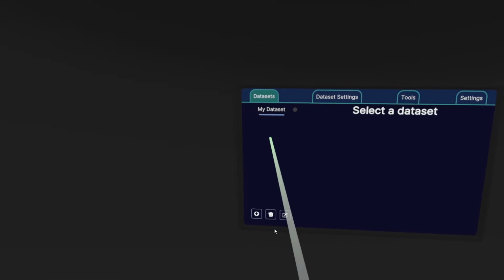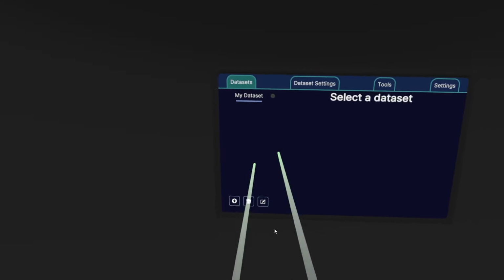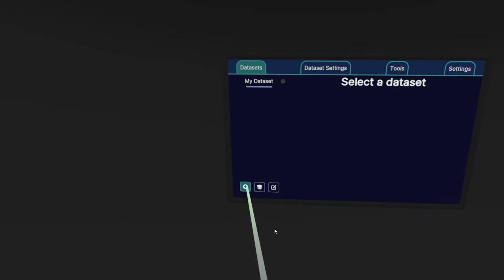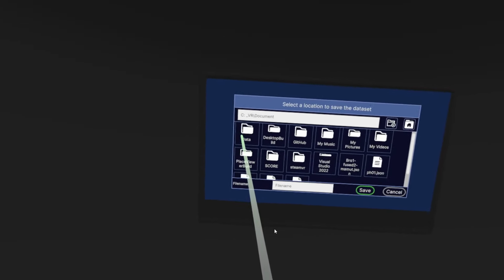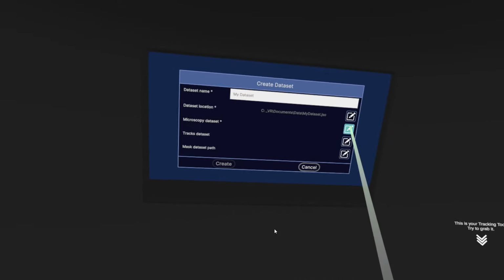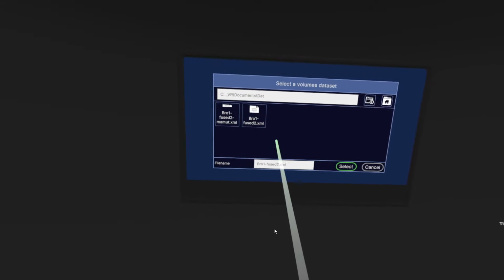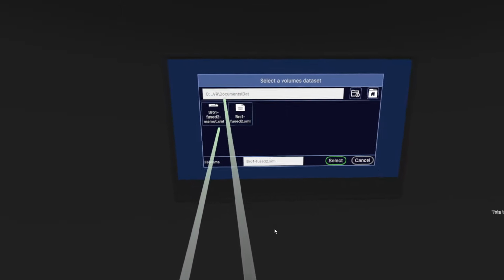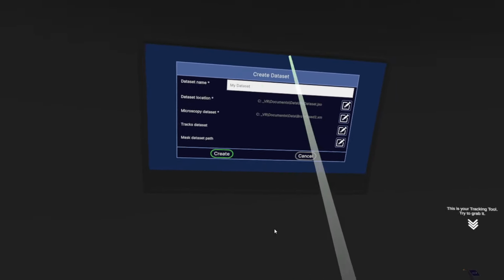Right, so we are going to have your datasets loaded here. If you want to add a dataset, for example, I'm actually going to erase this one by just overwriting over it, keeping the same name. So you just go into the location where you want to save your dataset. You then choose the microscopy dataset that you want to use. This is only for BigDataViewer format files for now, XML HDF5 file format. You're going to select it, right? And now here we have the minimum assets.